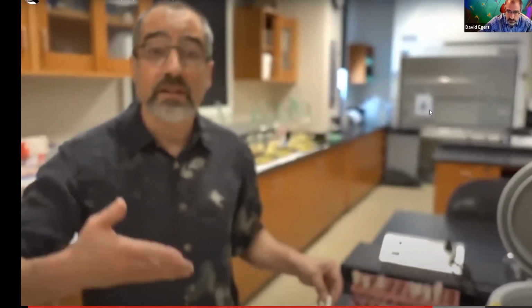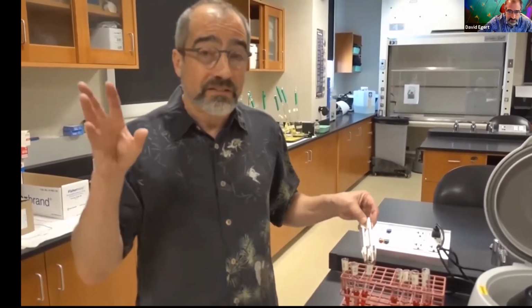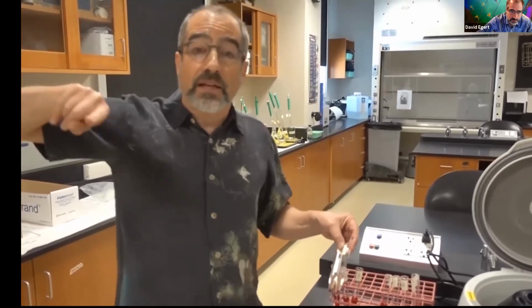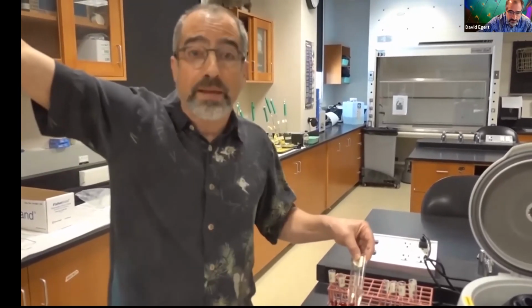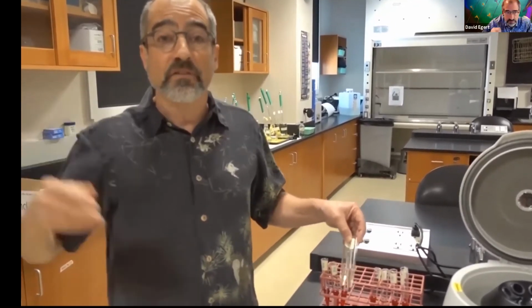And we're going to be able to follow up on that when we take them and look at them under the microscope. And obviously a crenated cell looks very different. It actually looks all shriveled up and spiky. You can see the cytoskeletal elements poking out against the membrane. They look kind of like, I don't know, pufferfish or something.